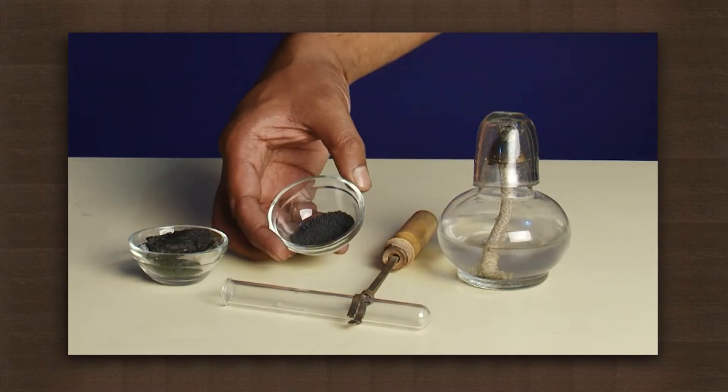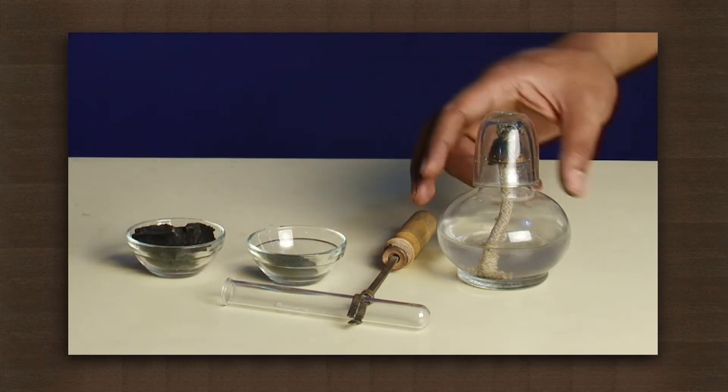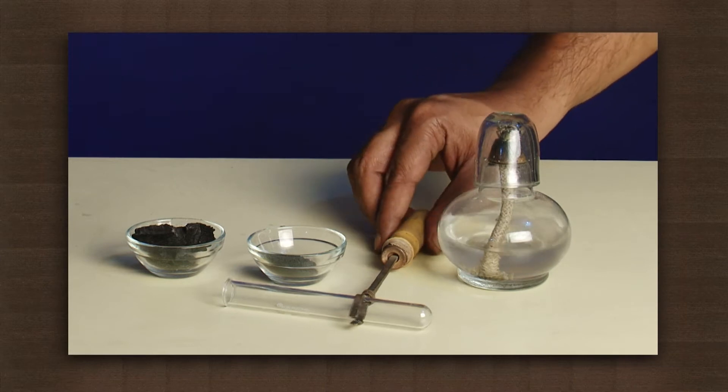Let us extract a metal from its metal oxide. For this we need copper oxide, charcoal, a burner and a test tube on a clamp.